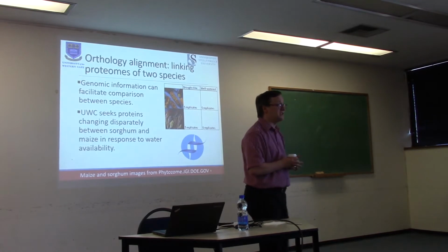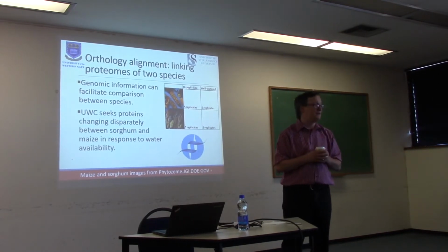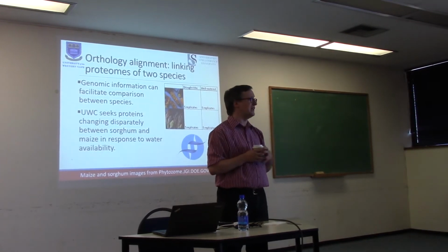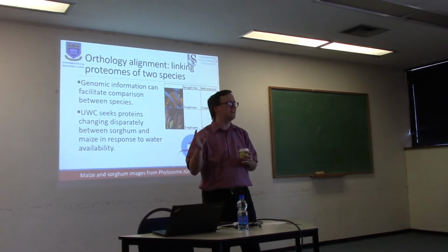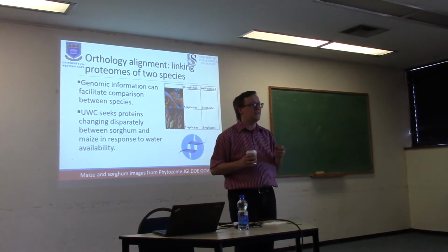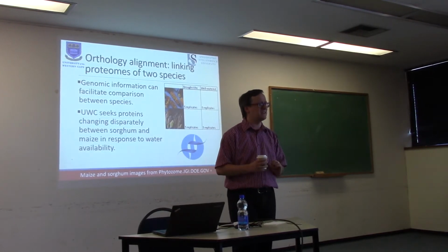When we switch gears into the fine world of agriculture, we sometimes find that we're in a very difficult place. A lot of the proteomes that we work with routinely, like H37Rv, like human, like mice for that matter, or yeast, these things have been tread over so many times that they've got excellent annotations, and there's not a whole lot that one can second guess about them.